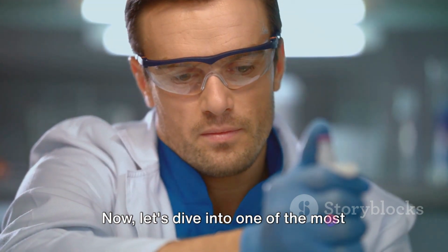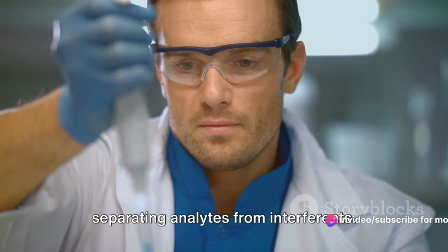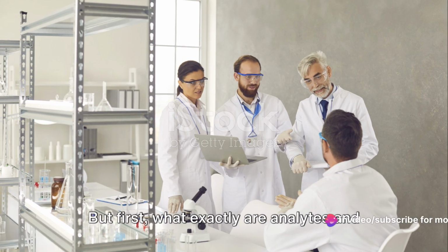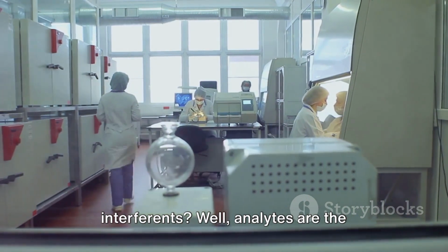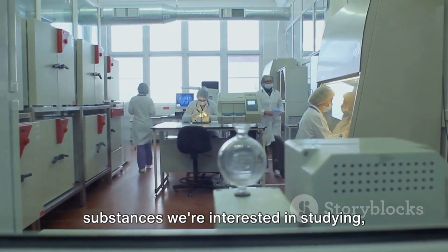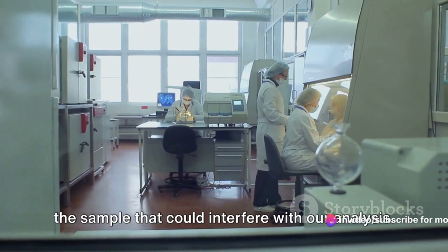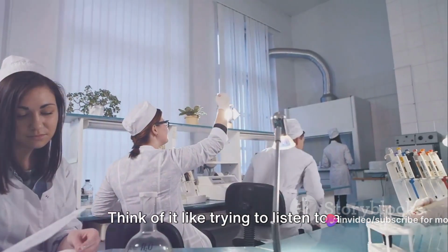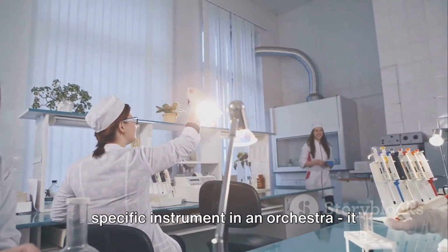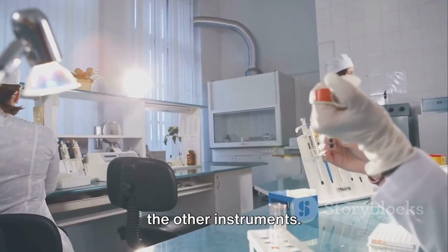Now let's dive into one of the most crucial aspects of sample preparation, separating analytes from interferents. But first, what exactly are analytes and interferents? Well, analytes are the substances we're interested in studying, while interferents are other substances in the sample that could interfere with our analysis. Think of it like trying to listen to a specific instrument in an orchestra. It becomes much easier if we can somehow mute the other instruments.